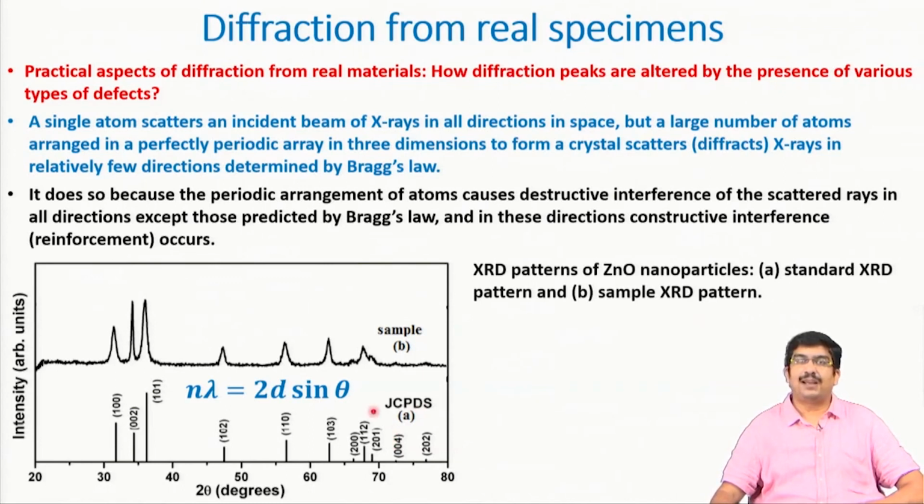Then you can very well generate this entire thing, and if you notice, this is giving you a line, that means at a particular 2 theta value you are getting this diffraction, and it has a particular intensity. So this is completely generated by you, you can take an Excel sheet and generate this entire diffraction profile, then you plot it.